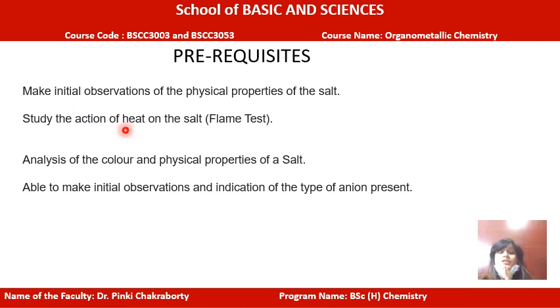First is the student should be able to make initial observation of the physical properties of the salt. Now, what do you mean by the physical properties of the salt? That is, if a salt is given to you, what is the color of the salt? If there is any smell coming out of the salt, and what are its physical properties, right? Whether it is a hygroscopic salt or it is a normal dry salt, all these things come under the physical properties.